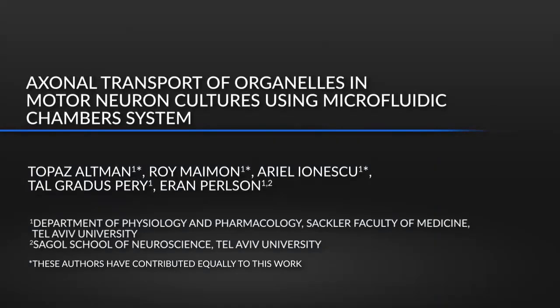Axonal transport is vital for neuronal health and viability. Our protocol describes an elegant method for monitoring and analyzing axonal transport and can be adapted for various neuronal disease models. The use of microfluidic chambers enables precise spatiotemporal control, which is crucial for studying axonal biology.